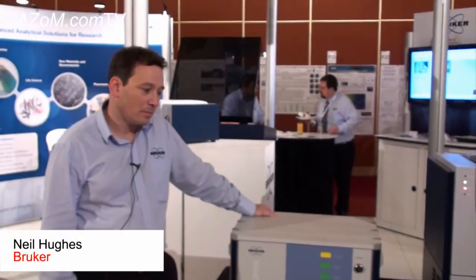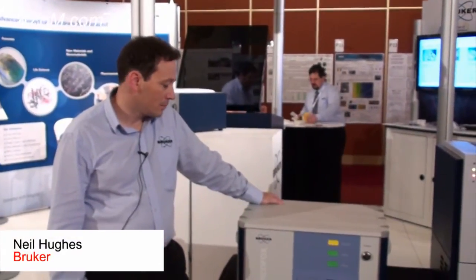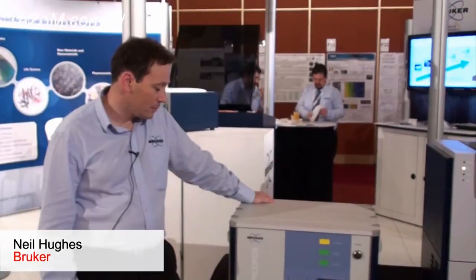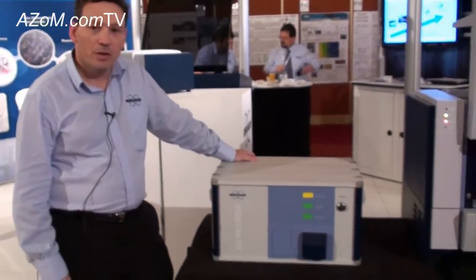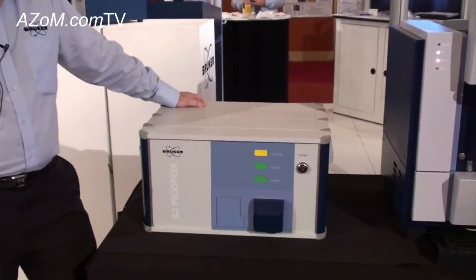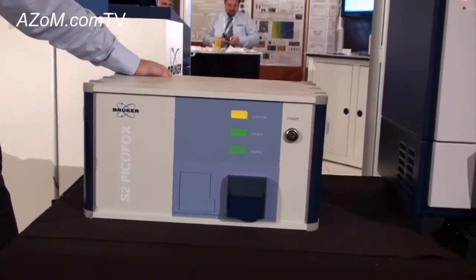This is Cameron Chai from Azon, bringing you another episode of Azon.com TV. Today we'll speak to Neil Hughes from Bruker, and he's going to tell us about their S2 PicoFox. The S2 PicoFox is a new technology — it's the total reflection x-ray fluorescence spectrometer.